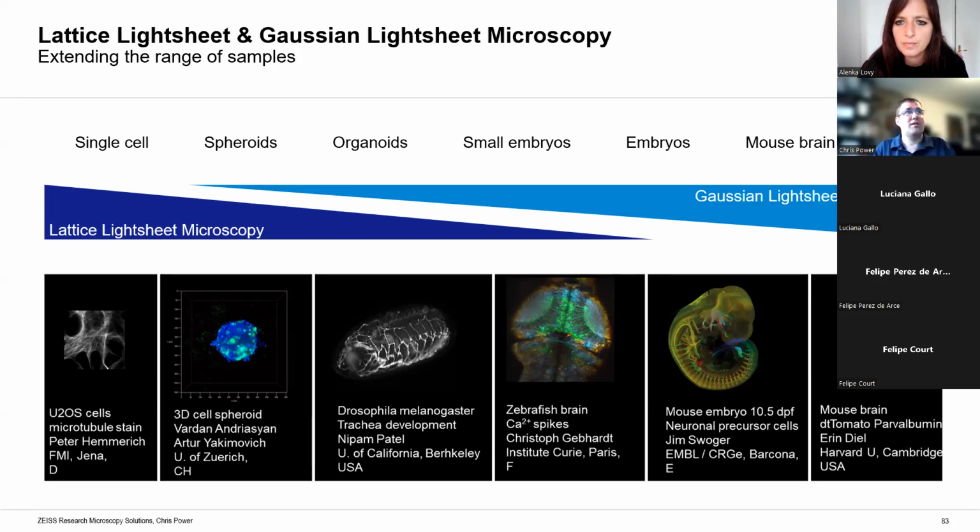The first one, the one that begins 000, sorry, I should have changed the file names, is a 44-page chapter from the manual which covers the different techniques. So if you're thinking, right, I've got fish, or I've got Drosophila, have a look through that chapter and it will give you an idea of some of the different ways to mount your samples. But if you've got something strange, feel free to ask now.